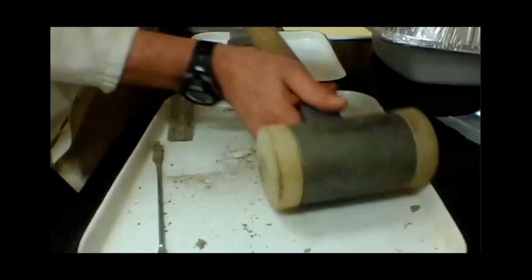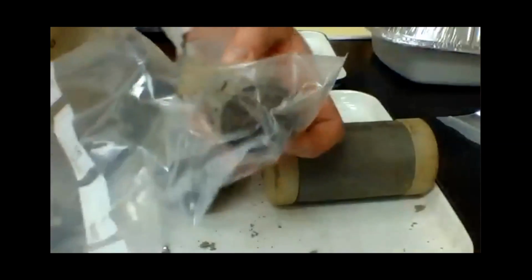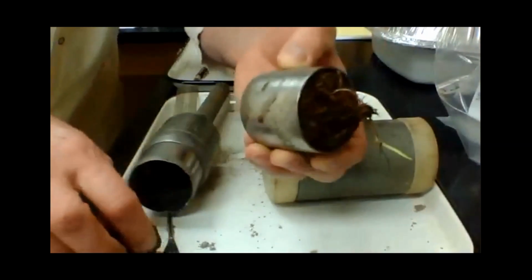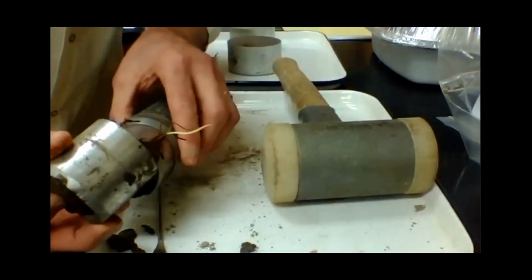So that's the sampler right there. Yesterday I was out digging in some snow to find some soil in Sault Ste. Marie so I could take a sample. So I've got an actual sample here from the field. Now you can see I've taken this sample in the field. The bulk density ring is full of soil, and I'm going to bring it back to the laboratory.